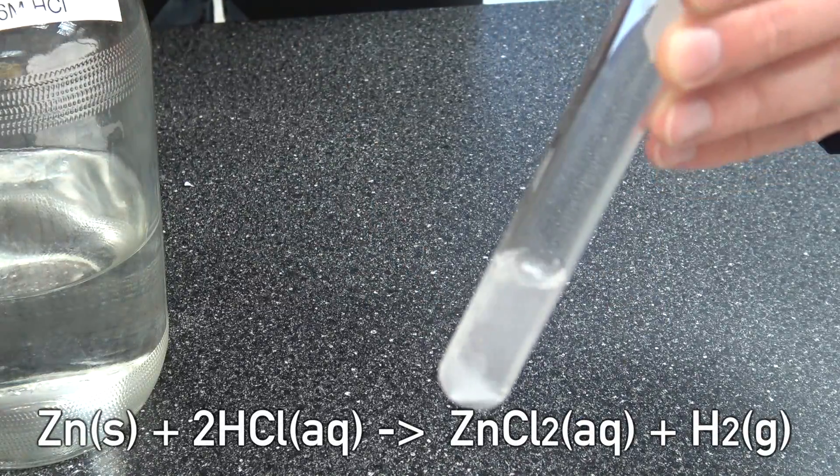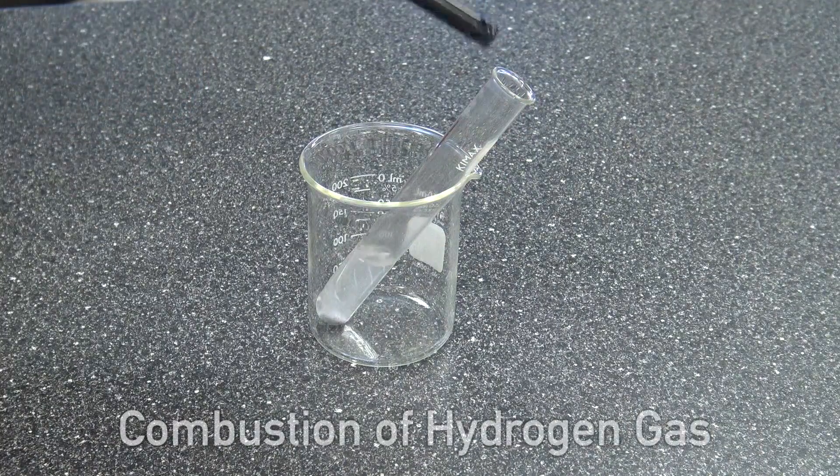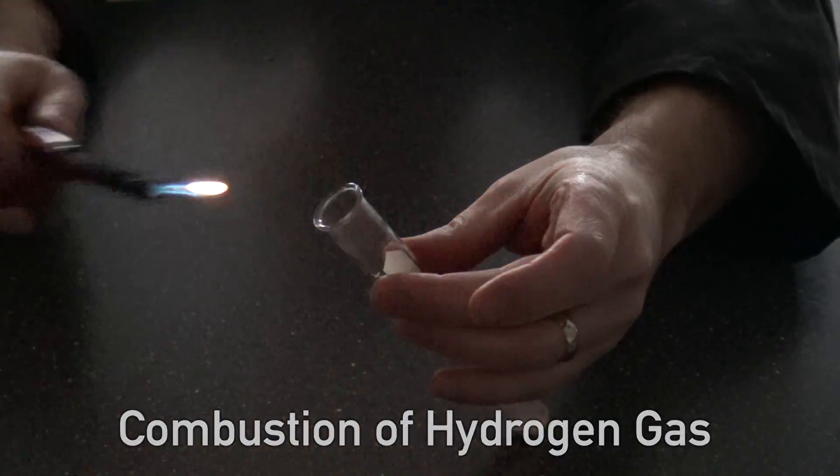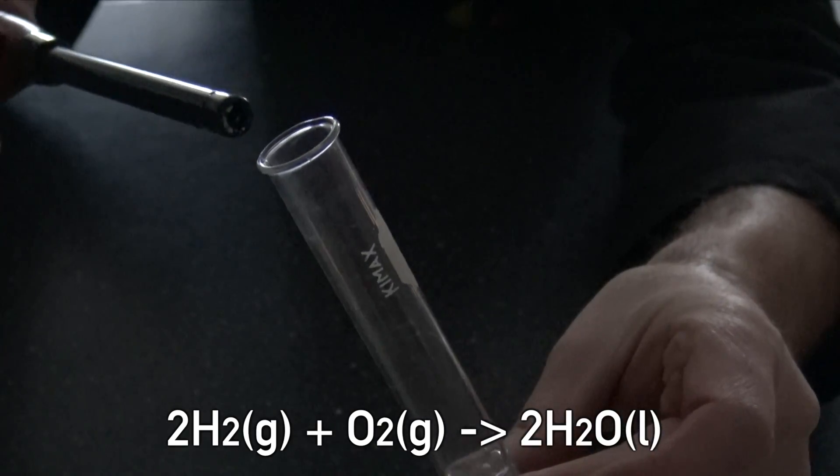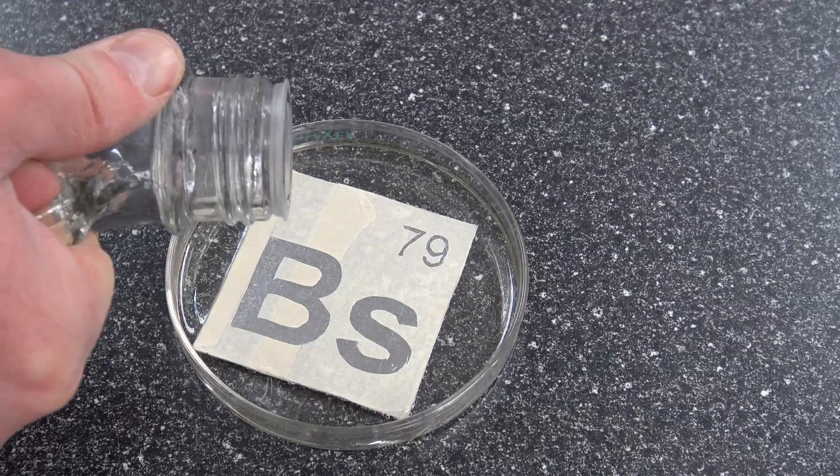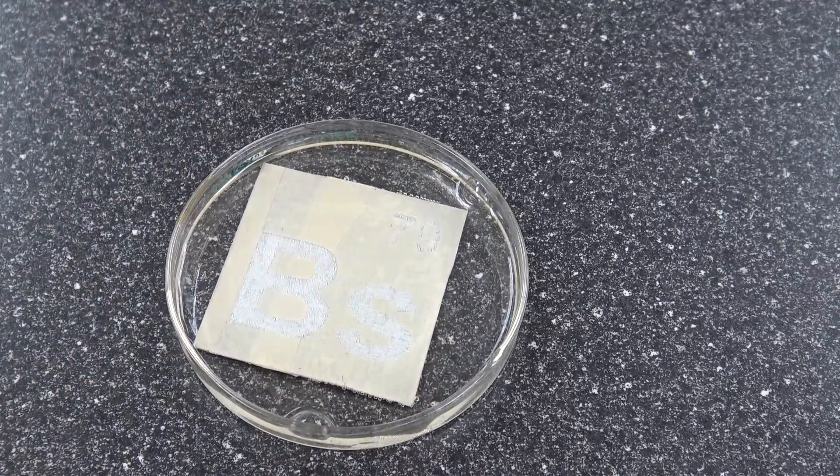So I've got some hydrochloric acid in this test tube. I dropped some zinc in there and you can see the reaction that's going on. We have a replacement reaction and we're creating hydrogen gas. Now that hydrogen gas is combustible. Look at this. And when we light it on fire we're just making water. Hydrogen combines with oxygen to make water.